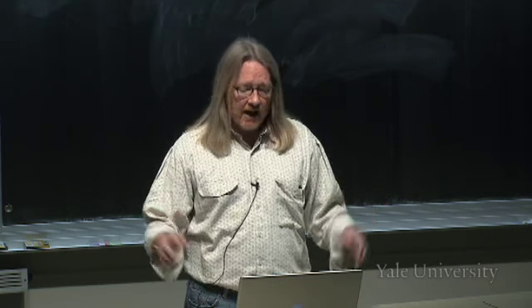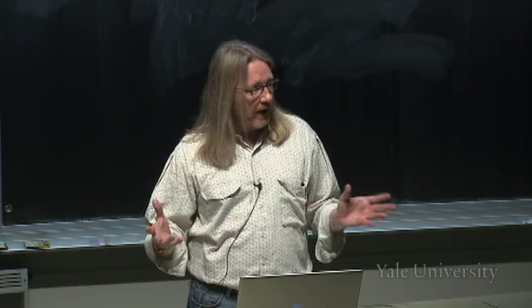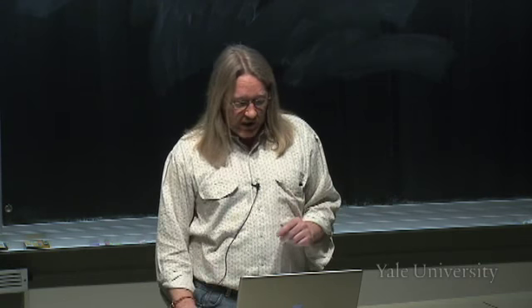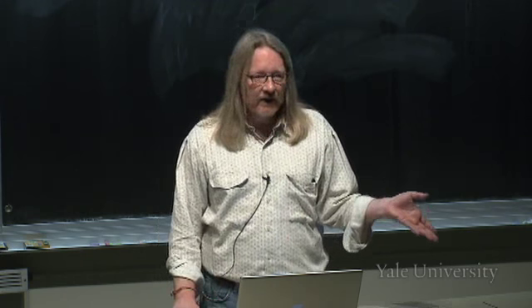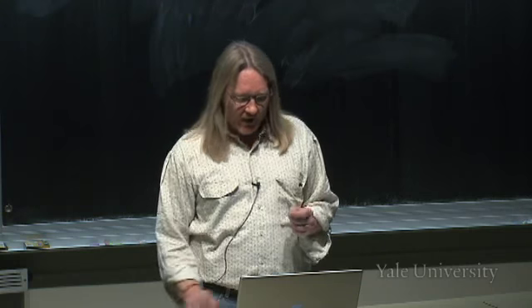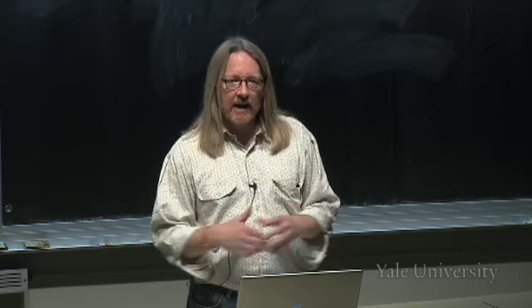We're very sophisticated at using light to make images like this now on microscope stages. And one can take very beautiful pictures of biological objects like cells with different kinds of optical techniques. This is familiar to you. This is a glomerulus. And I told you what a glomerulus was last week, but this shows the tuft of capillaries inside a glomerulus imaged by light microscopy.